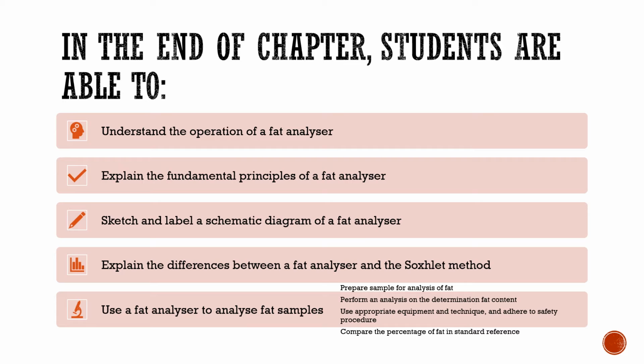How? You will know how to prepare the sample. You will know how to perform the analysis to determine the fat content, and you will know how to appropriately use the equipment and technique, together with the safety procedure. After the analysis, you will know how to compare the percentage of fat in the standard reference.